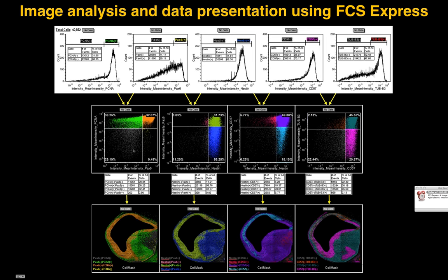And now, what's very interesting is that you take this, and something that conventional flow cytometry can never do, is we actually have spatial information from this bivariate plot, because not only do we have accountability of all the cells inside that tissue, we can then pseudo-color the patterns of cells in the cell mask image plot, and you can actually see and reproduce not only where the cells are, but where their specific phenotypes are.